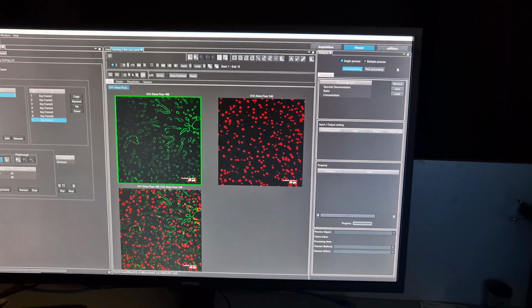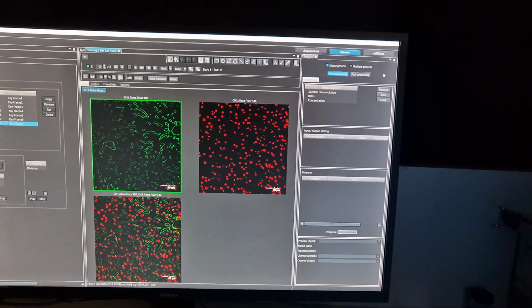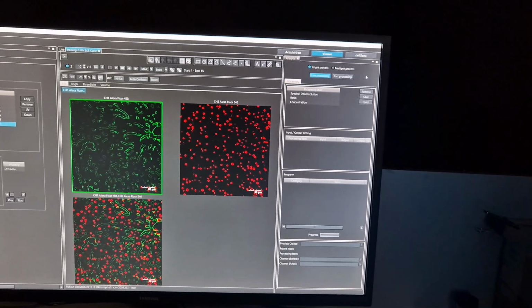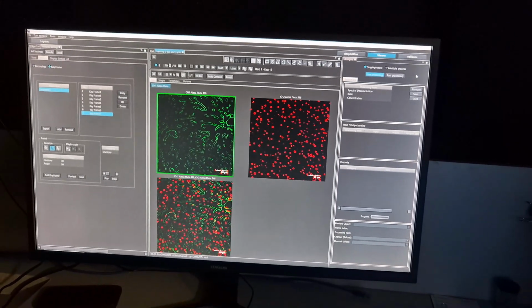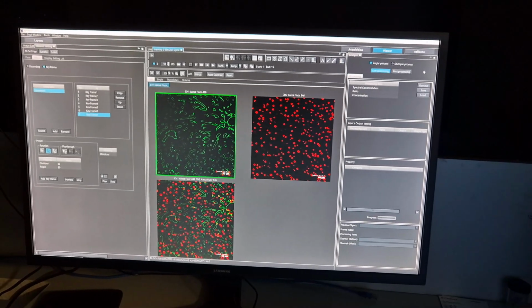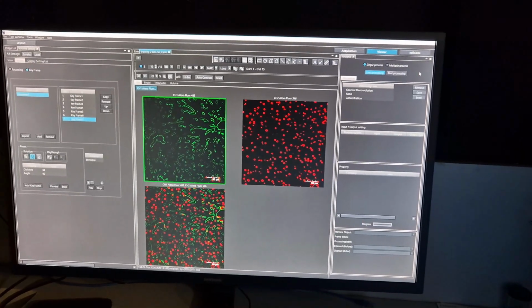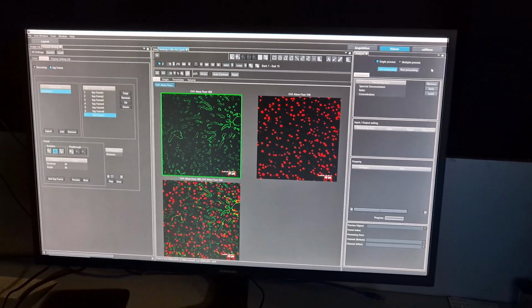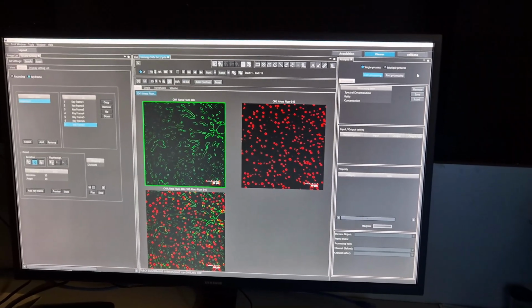Then you start gating on what it is you want to measure. So you can say, okay, everything over this size, exclude. Everything that's this shape, morphology, shape factor, exclude or include. Then you end up with a really tight measurement of whatever it is. And what it's measuring is almost anything you can possibly imagine, not just the intensity or the size, or if something that is red is also blue, but heaps of stuff.